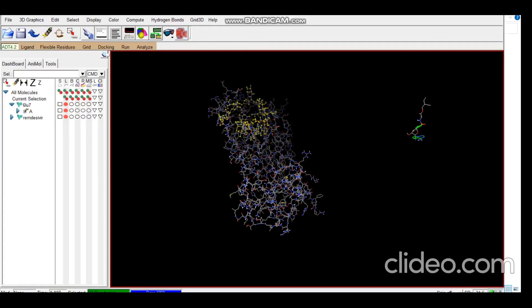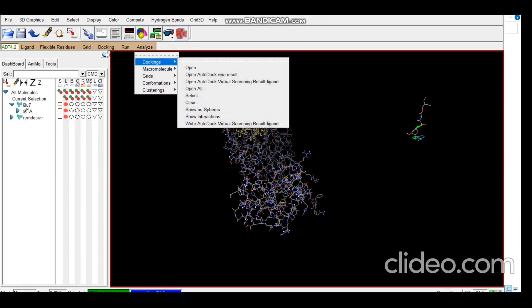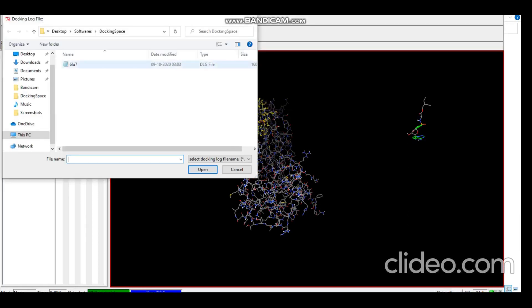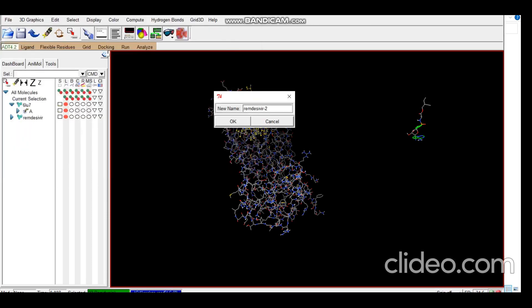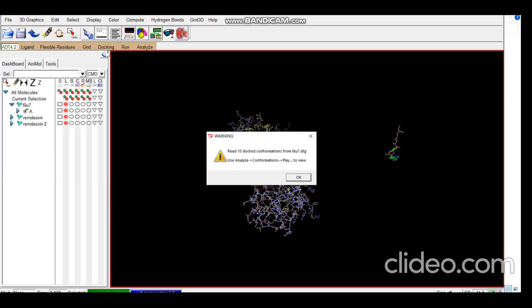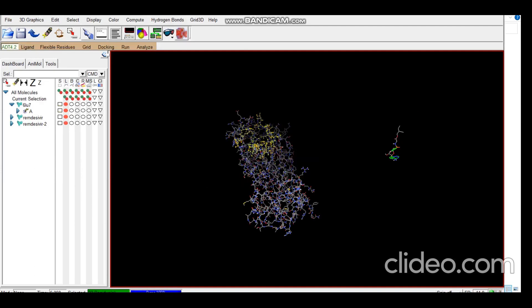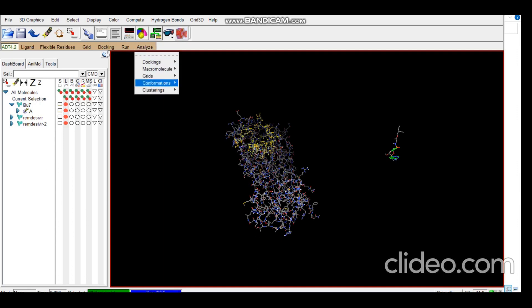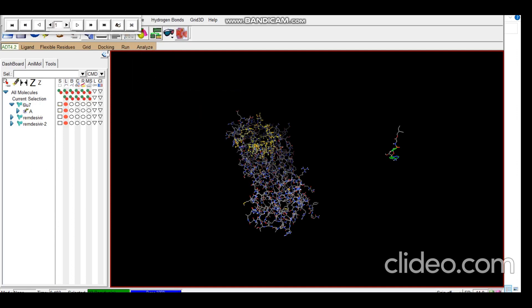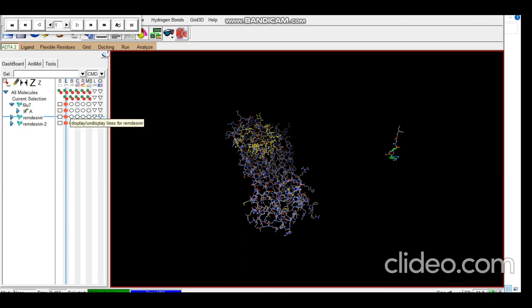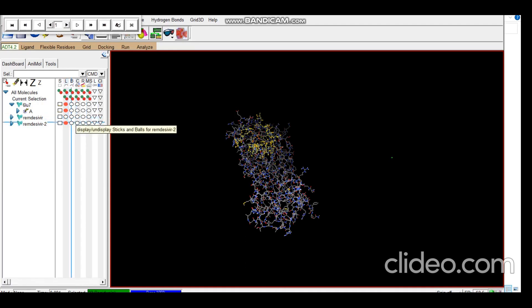Now we can even analyze the docking. For that we go to Analyze Docking, open the DLG file, okay, and we go to Conformations, Play, Rank by Energy. Just to show you clearly I'll hide the initial remdesivir structure and make this representation sticks and balls.